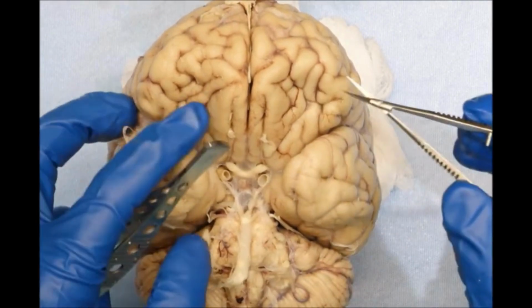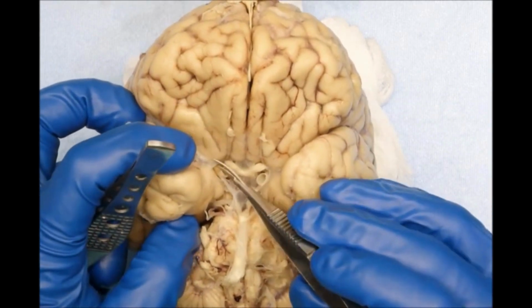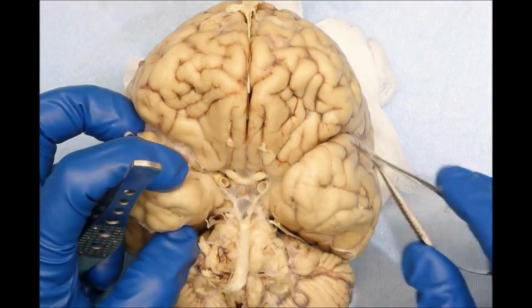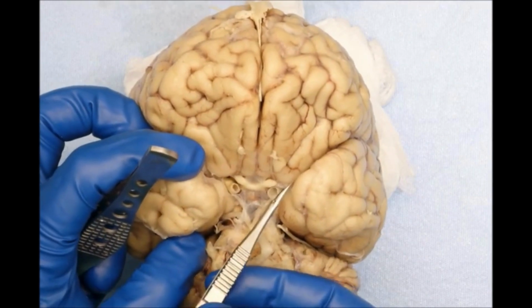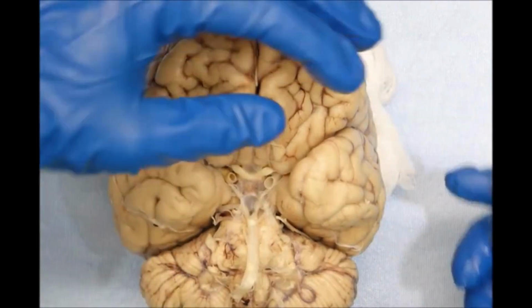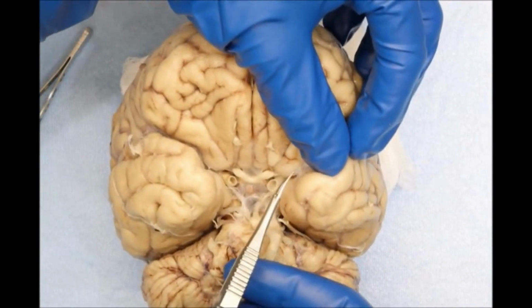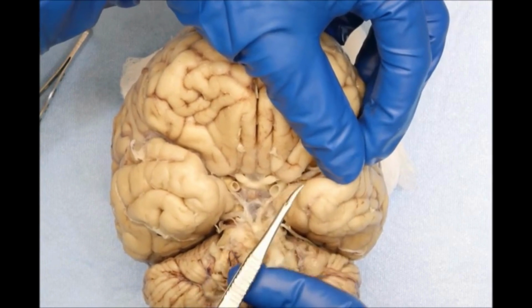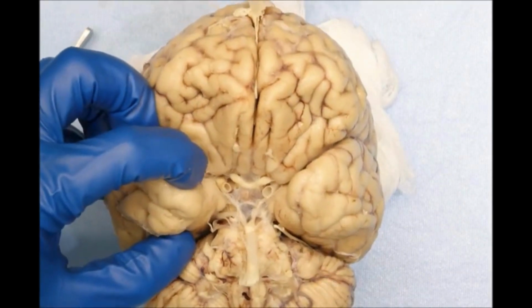So we've got to remove those membranes and expose the vessels I need to transect in order to get out the circle of Willis. Now, as I section through the membranes on this side, you'll see a longitudinal portion of vessel, which is your left middle cerebral artery.